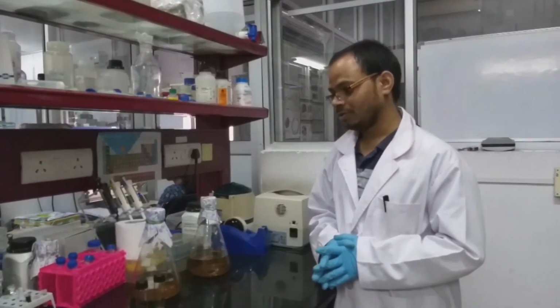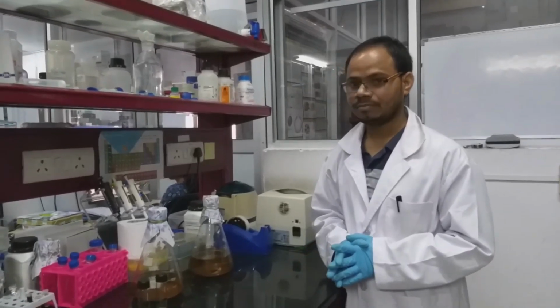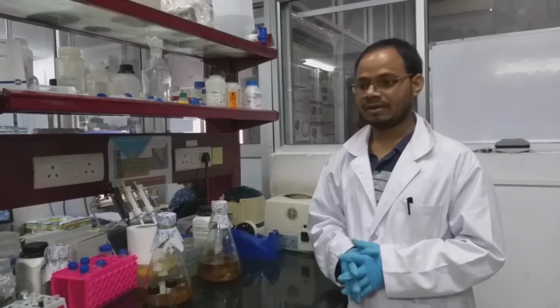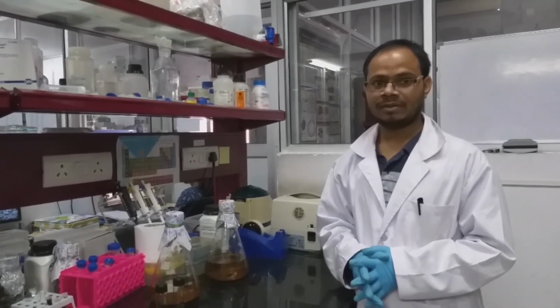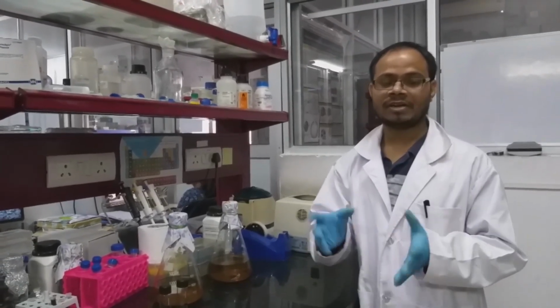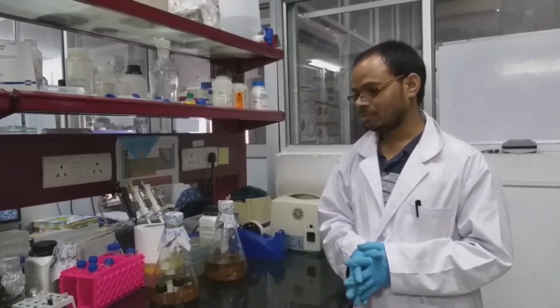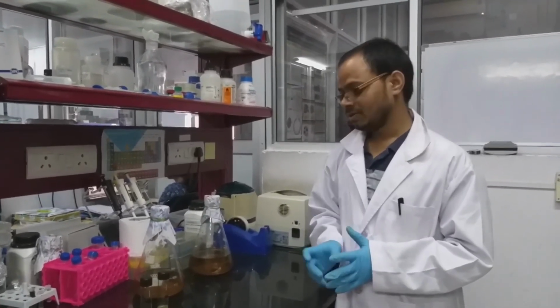We also have to remember to include a suitable resistance marker like ampicillin or kanamycin, this kind of antibiotics. This depends upon what resistant vector you are having. In this case we are using ampicillin as an antibiotic. So let's start.